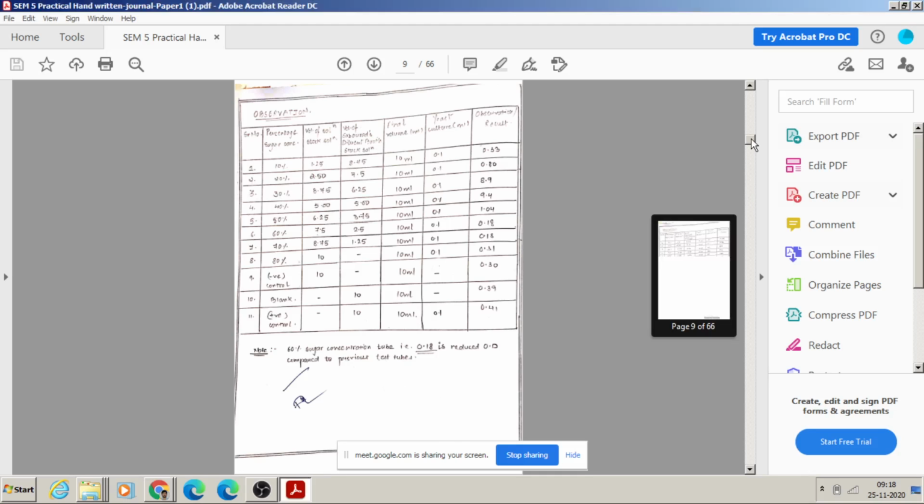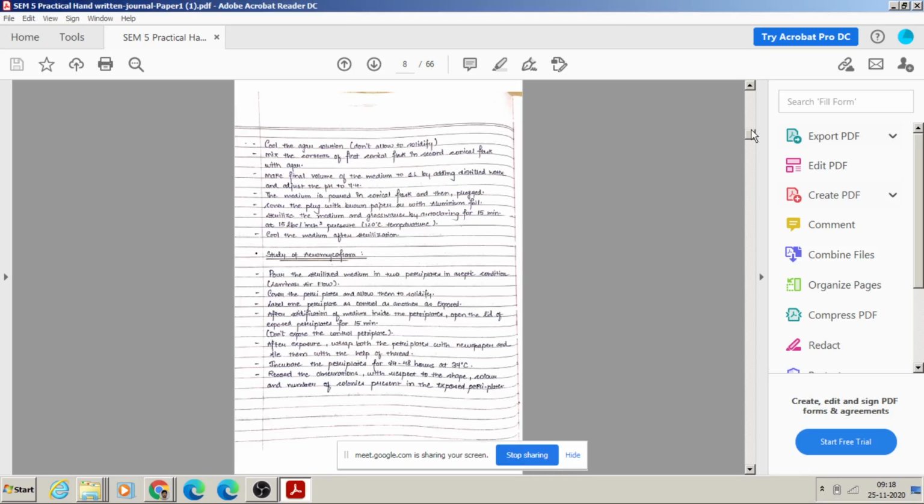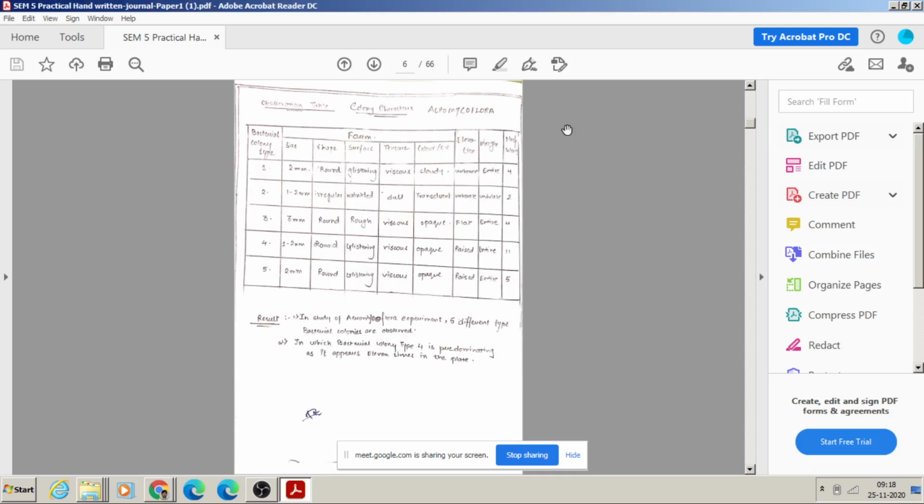So dear students, if you remember, last time we came across a practical, that is, the minimum inhibitory concentration of a sucrose solution for yeast activity, and at that time you simply prepared a write-up and submitted it as a part of your submission. But how that particular practical gets performed, that part of the discussion was remaining. So now I'll give you a brief idea about in what way the minimum inhibitory concentration experiment may be performed.